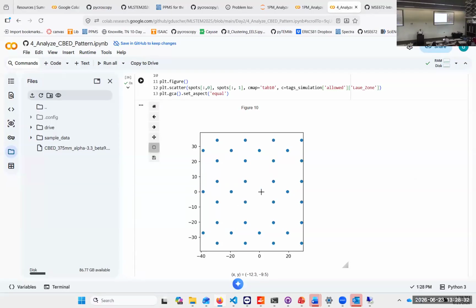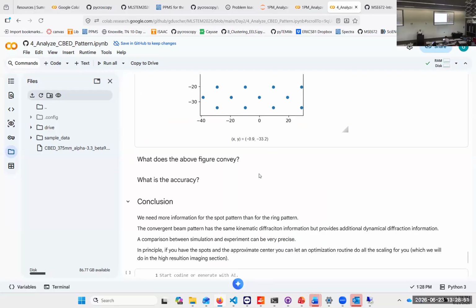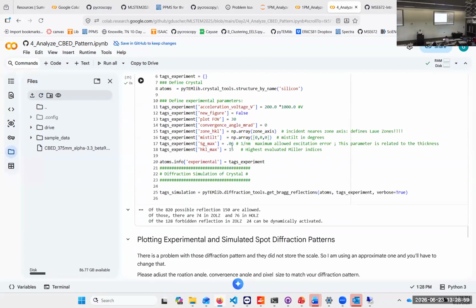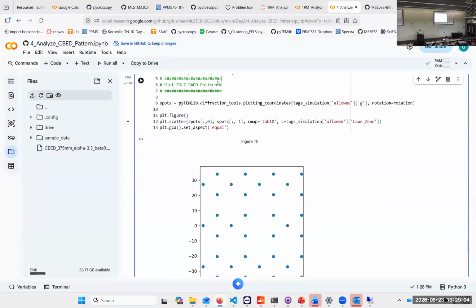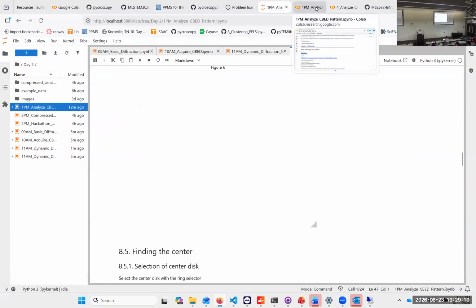So if you diffract in this direction and in this direction and in that direction, so first we diffract here, then we go to the diffraction in this direction, then we end up here, right? So we have an extra one that we can plot if we want to. This is not the right one. That's not where I want to be either.